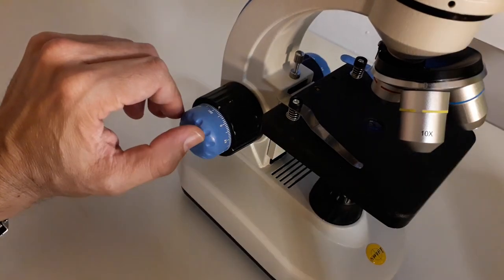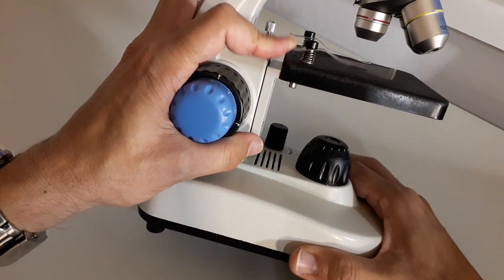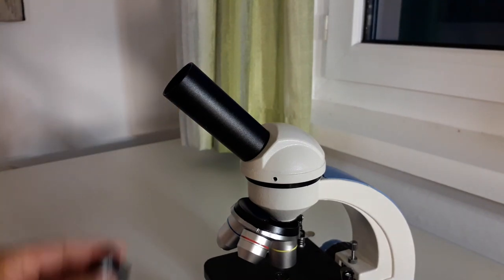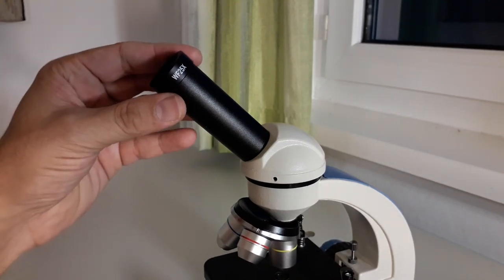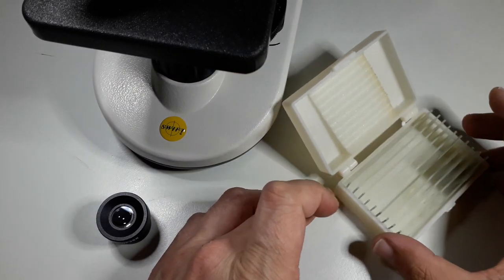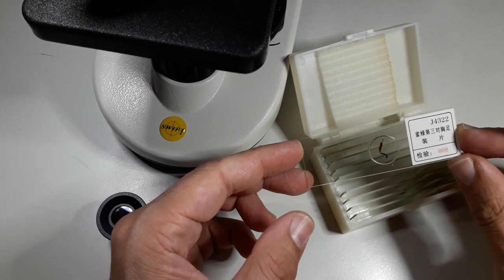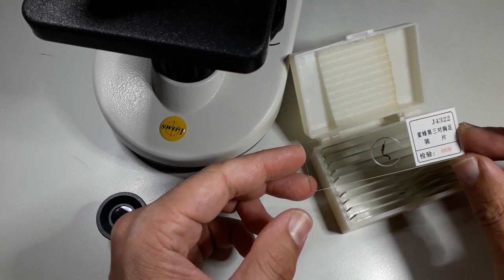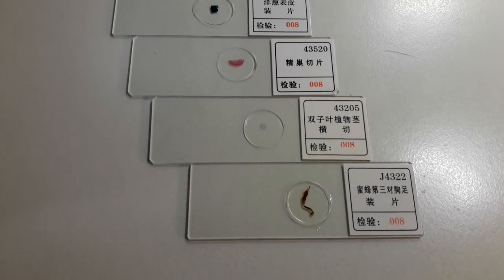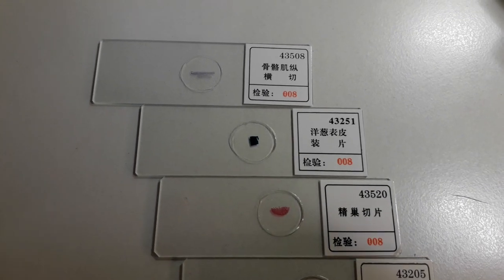So the microscope itself is supplied with clips instead of a mechanical stage. However, the eyepiece standard is such that it is able to also accept other eyepieces as well. And the supplied slides are standard slides. I had some problems reading the Chinese, I have to admit, but I could identify all of the slides.